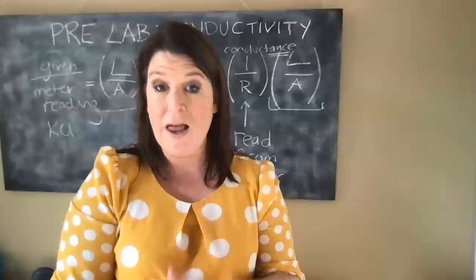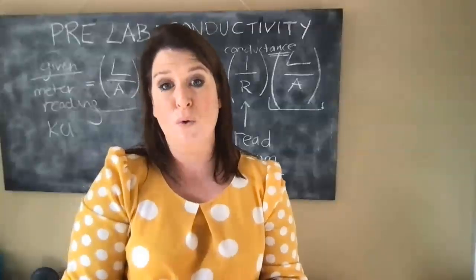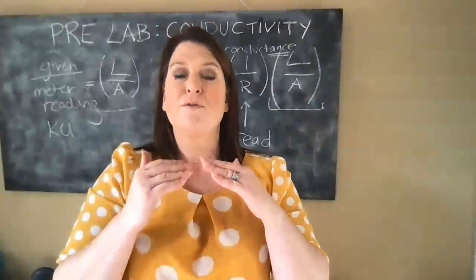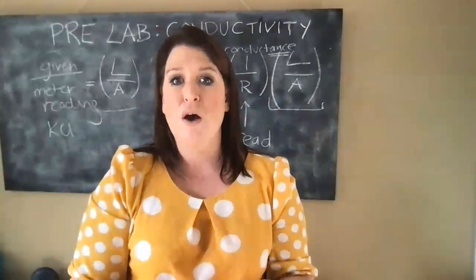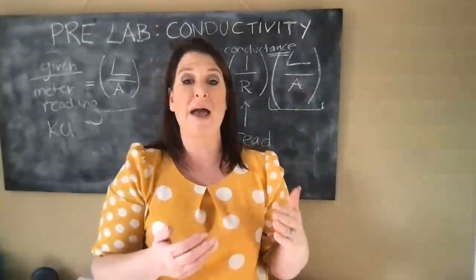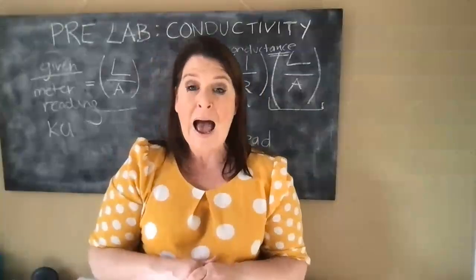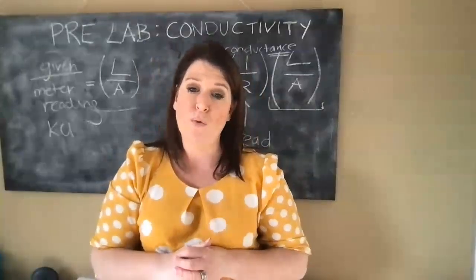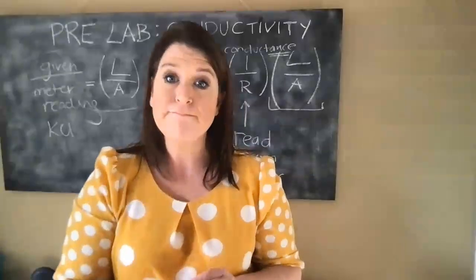I will be floating around the labs if you have any questions, and the demonstrators will also be there. But I would strongly advise that you come to the lab familiar with everything, ready to go, and have a go at the calculations to determine how much of each species you need to weigh out. You will have seen how to go about approaching that in the stoichiometry workshop that will be done with the Beer-Lambert law. Best of luck.